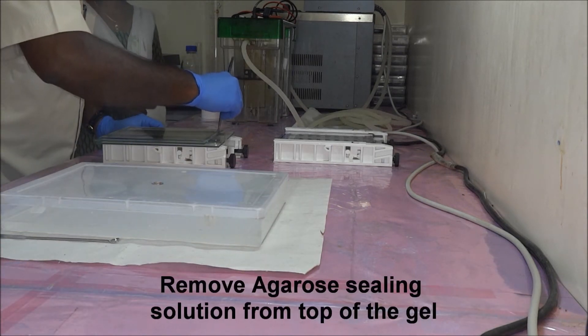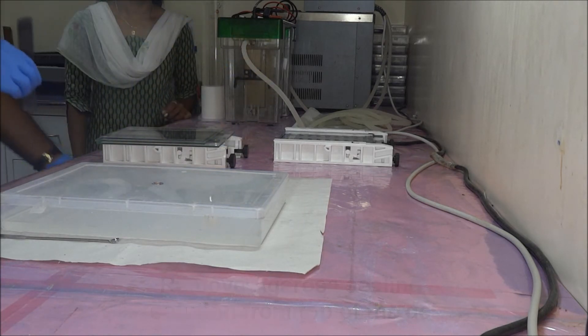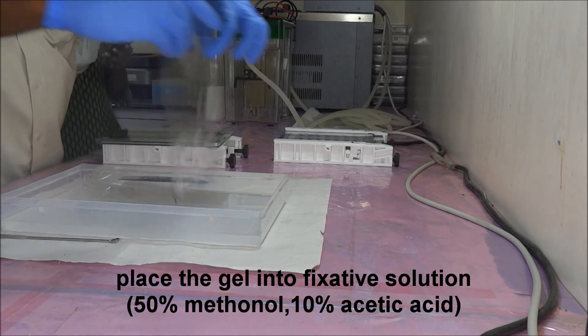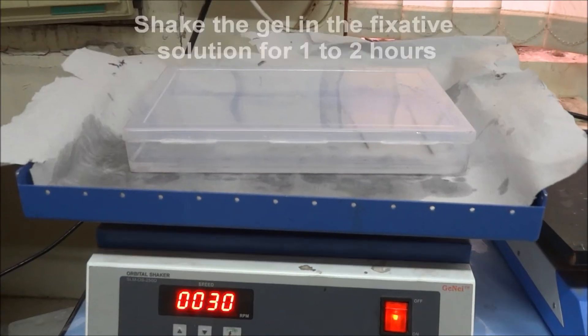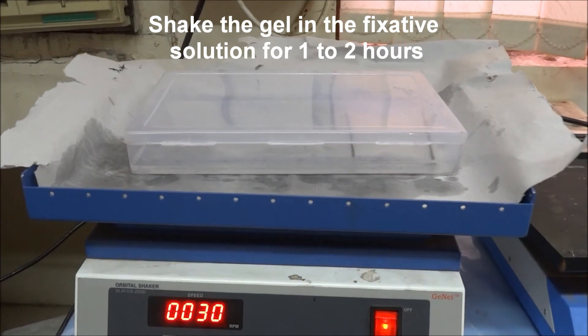Cut and remove the agarose sealing solution from the top of the gel. Place the gel into fixative solution. Fixative solution contains 50% methanol and 10% acetic acid. Soak the gel in fixative solution for 1 to 2 hours.